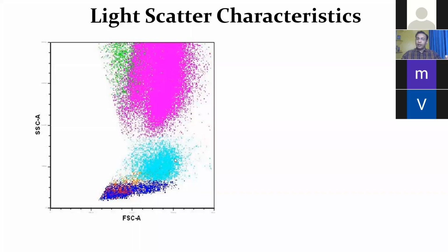Many times, if the flow cytometrist is not experienced enough, and if we just gate on lymphoid cells, they can miss hairy cells, because hairy cells have a lot of cytoplasm, and that's why their size is larger, and they generally sit in the monocyte area. The same way DLBCL cells, diffuse large B cells, also sit in this area. That's why morphology is important, because based on the morphology we know where to gate. Or if somebody doesn't have morphology, the cytometrists or pathologists have to look at all areas when analyzing, including the monocyte area, granulocytic area, as well as this lymphoid area.